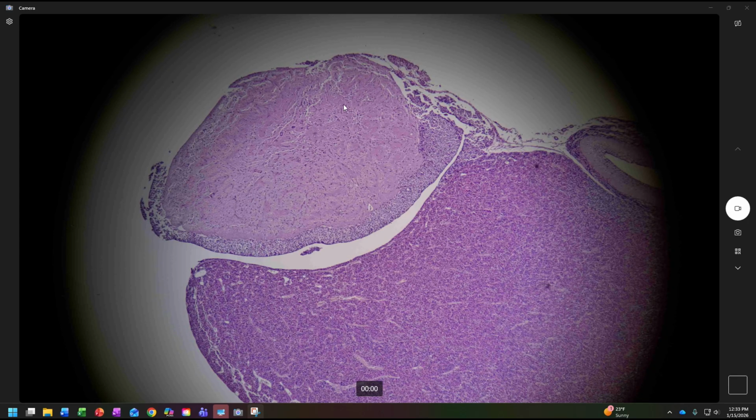Okay, so first of all, we see these two large regions, one's kind of smaller, one's very large. That's typically, not always, but typically how this works out, so don't hang your hat on that. Because remember, we're not depending on color, we're not depending on things that can change, we're depending on things that are consistent. So what are the things that are consistent? First of all, we're going to have these two different stain texture areas, and we're talking visual texture here. That's one of the first things you can go to and know that this is a pituitary gland.